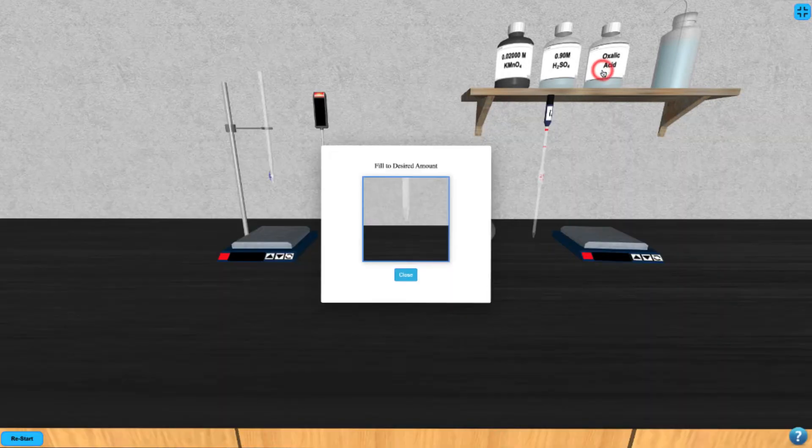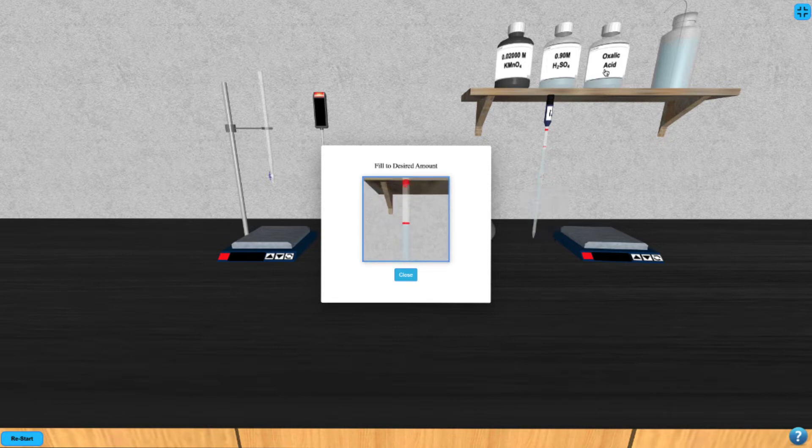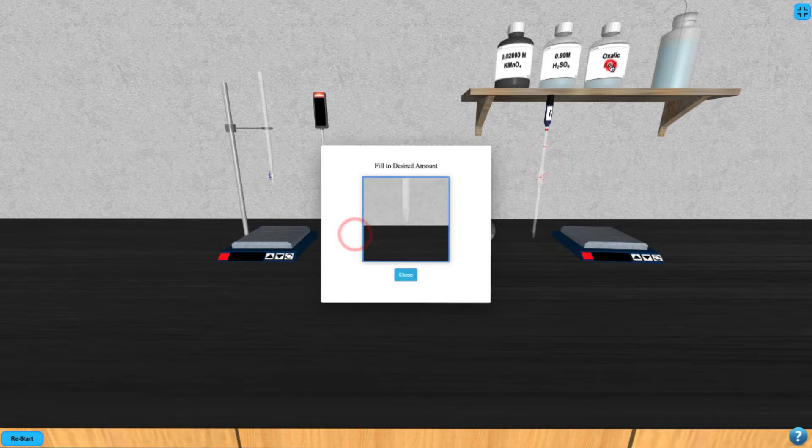To begin, click the oxalic acid and use your up arrow to draw up 25 milliliters into the pipette. Then, click on the pipette to add the acid to the volumetric flask.